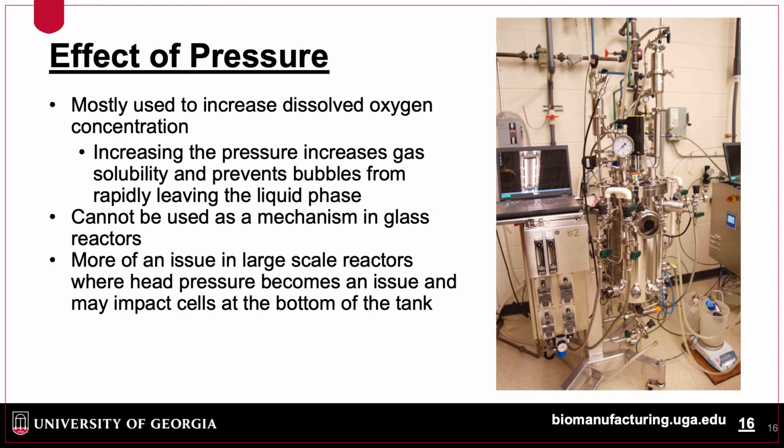Increasing pressure, which is only done in stainless steel systems, can be used to increase dissolved oxygen concentration. This strategy isn't used often in smaller systems, but is employed in larger systems when head pressure becomes an issue and may impact cells at the bottom of the tank.